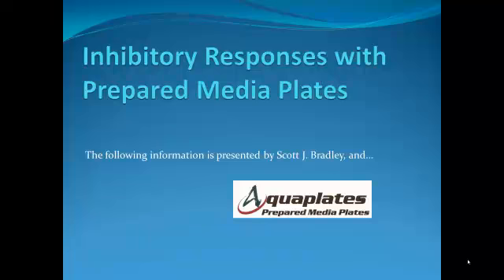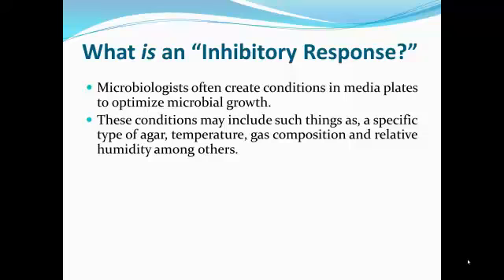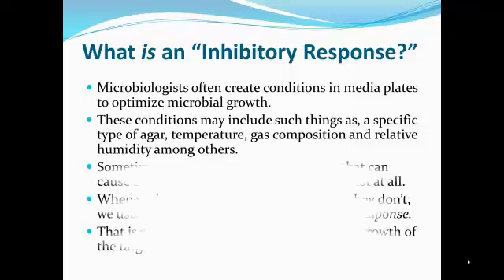Inhibitory responses with prepared media plates. What is an inhibitory response? Microbiologists often create conditions in media plates to optimize microbial growth. These conditions may include such things as a specific type of agar, temperature, gas composition, and relative humidity, among others.